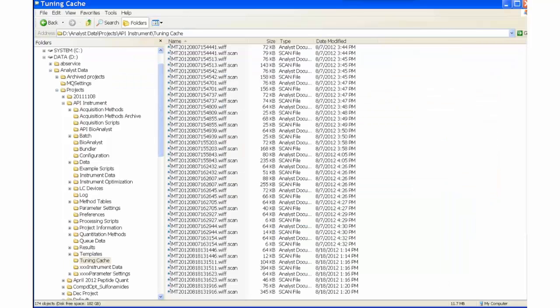The data being generated is saved with a generic name in the Tuning Cache folder. The data file name contains the year, month, day, and time.